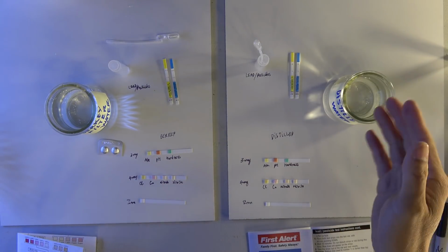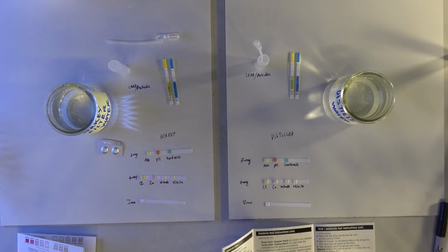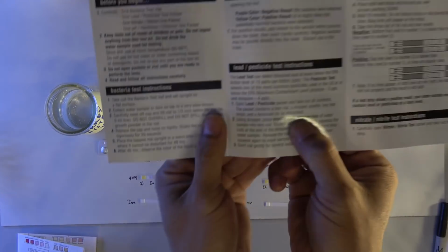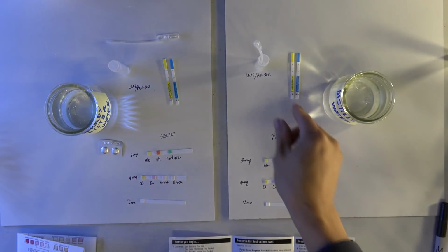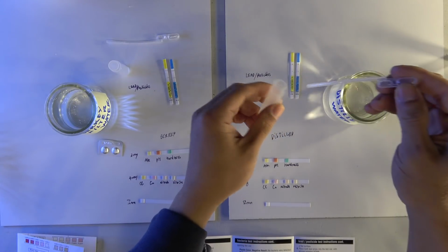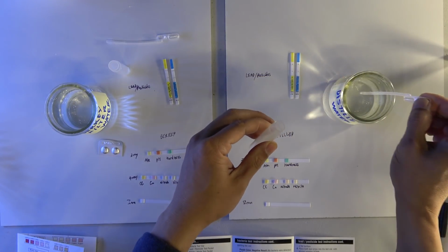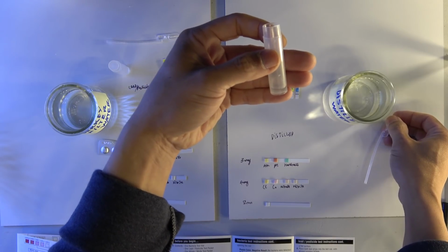I'm going to do the same thing on this side, except that you need 2 dropper fulls. That's what it says here, 2 dropper fulls of water. It looks exactly the same, but here we go. Okay, a little bit more than the other side.